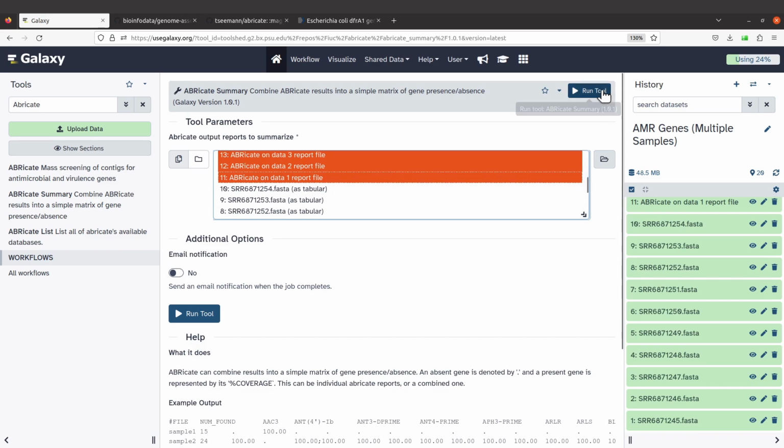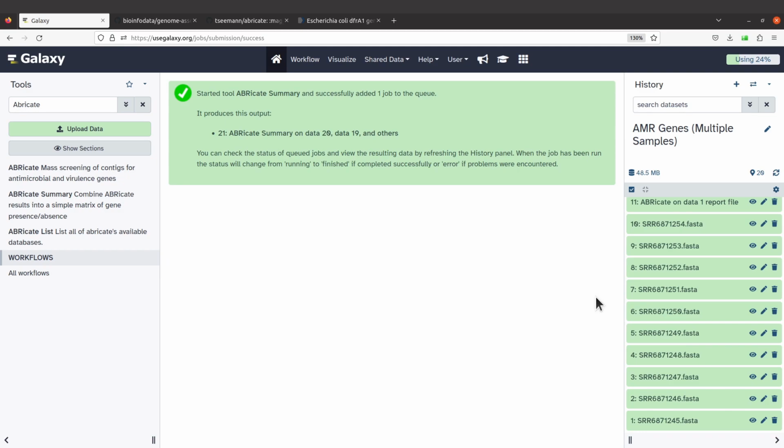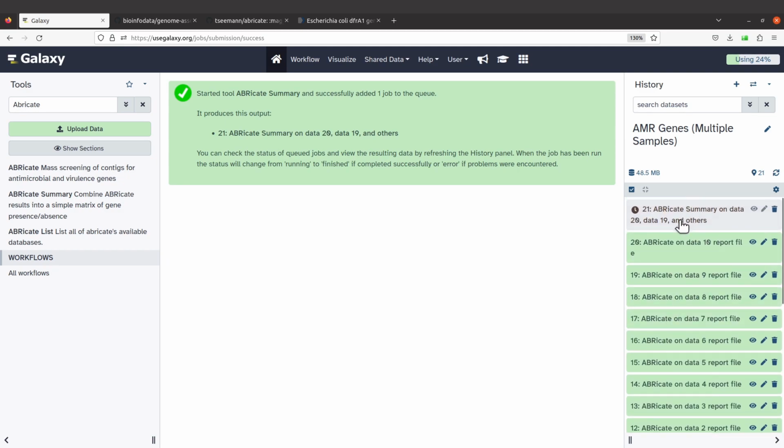So once you have done that, come to this side and run it. Click it, and when you click it, the summary file will be generated. You have to check this side for the output. You will see the output displayed here. We have to wait for the background to turn green. That means that the report summary, or let's say the summary file, has been generated. So we have to wait for it to get done for us. Okay, so we have that here.